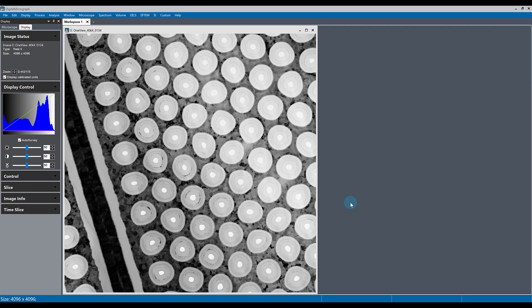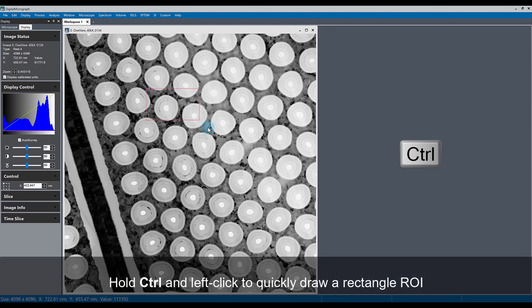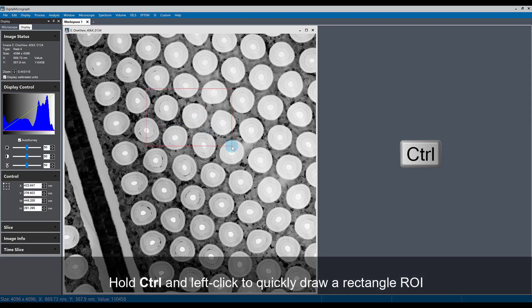Regardless of the kind of image you're working with in digital micrograph, the fastest way to draw an ROI is by holding the control key and then left-clicking and dragging across the image to create a rectangle ROI.